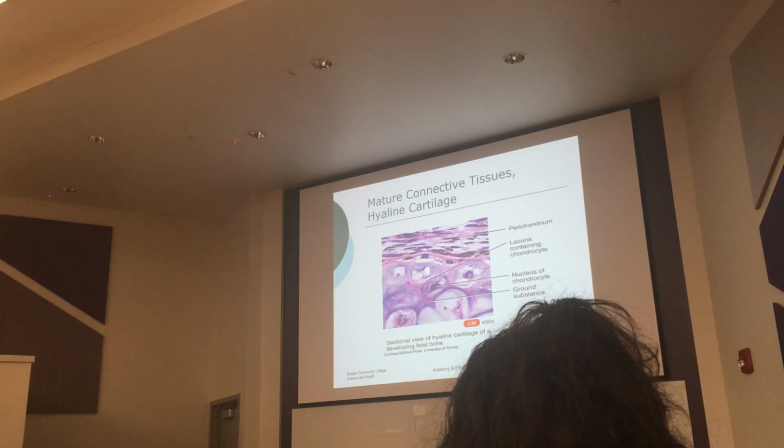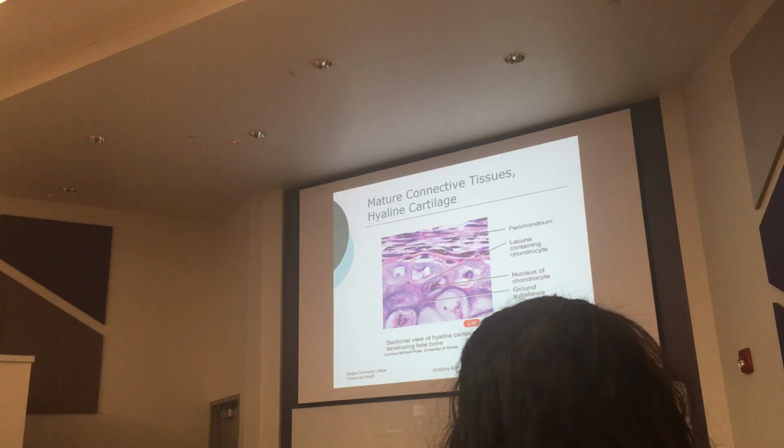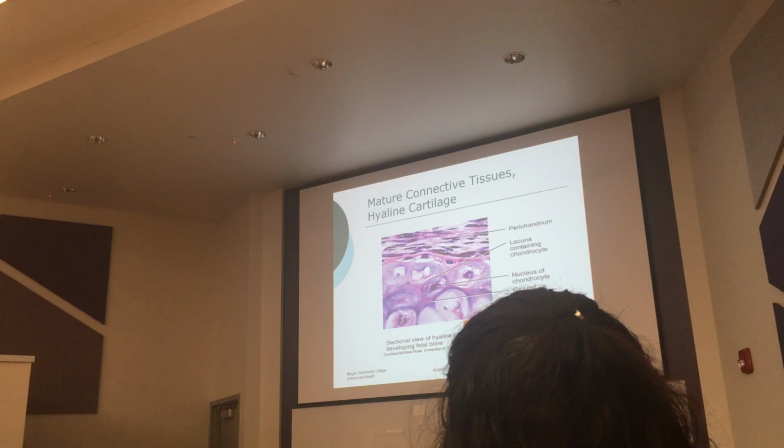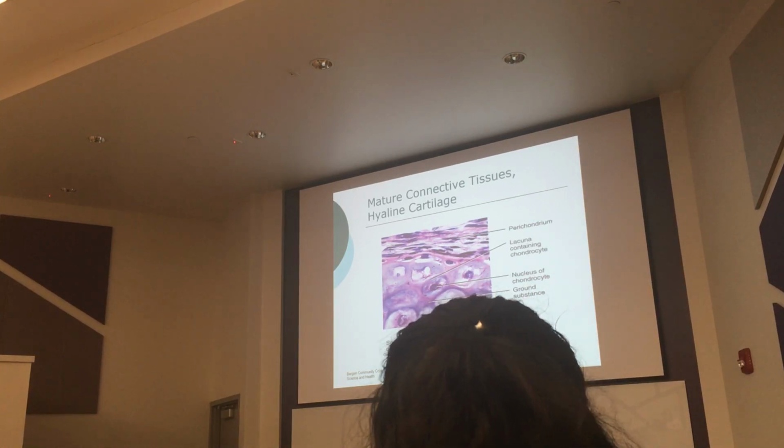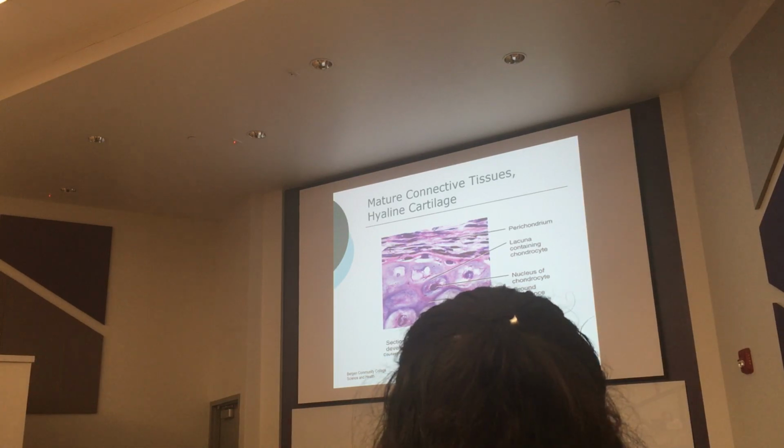Okay, so cartilage cells look like no other cells. These are huge, fat, happy cells. Look how happy these are. These are cartilage cells. So this is actually fetal bone. Your bones are basically cartilage, and then they get hard. We'll show you how bone growth works, okay?